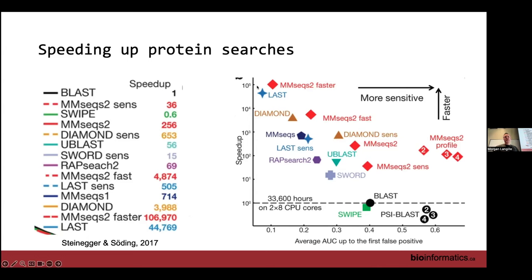So you've basically done mapping of genes to pathways, and then you've decided on these numbers, essentially. And then that's the question of, do I have to do any other normalization or scaling, essentially? There are a few options here, and we'll talk about them. I think the most obvious one is that often people will try to scale those numbers, accounting for the size of the gene family that they've hit. And this is quite easy to think about, I think.